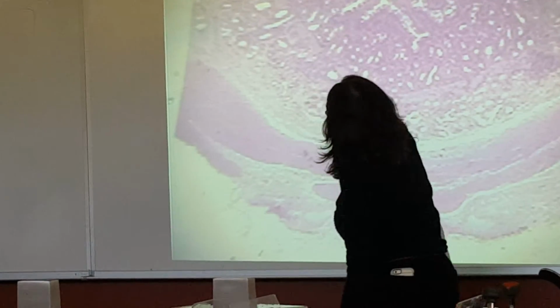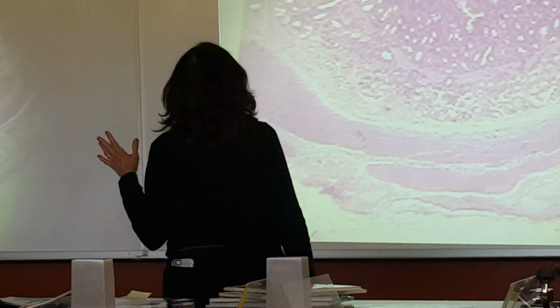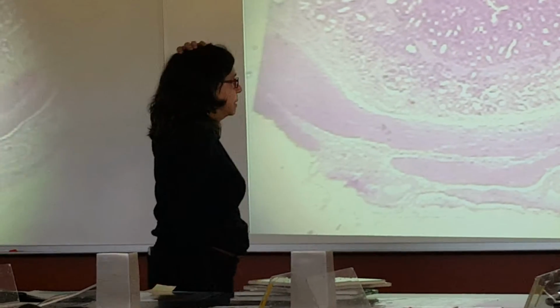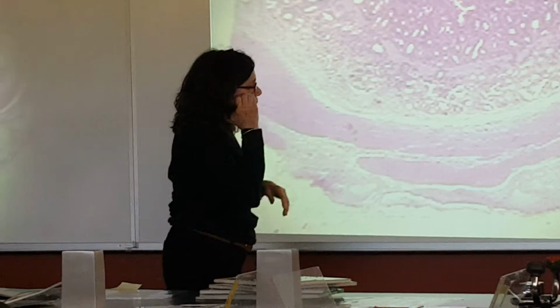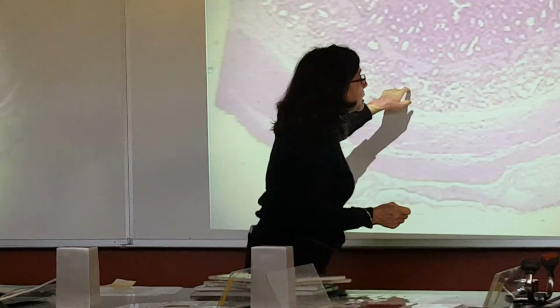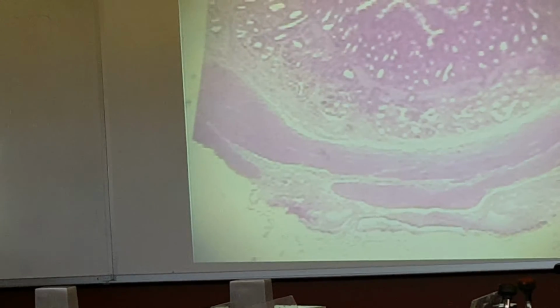Underneath the mucosa is submucosa, a more dense connective tissue, as I said in the video. This one is a looser connective tissue in the lamina propria, the connective tissue part of the mucosa. So there's a submucosa, and in the duodenum, the submucosa has duodenal glands, which I can maybe see with a higher power.